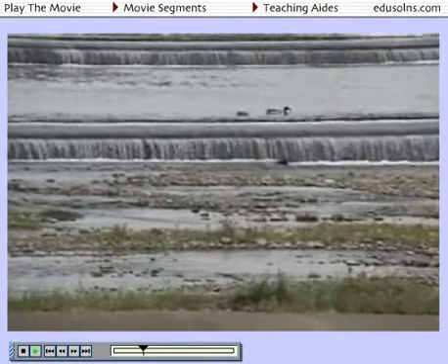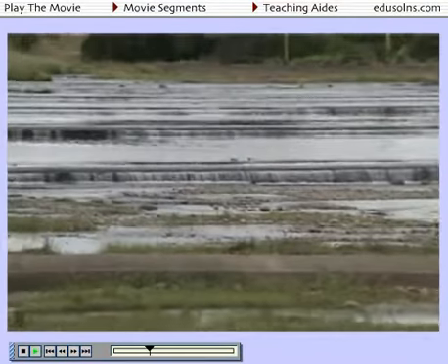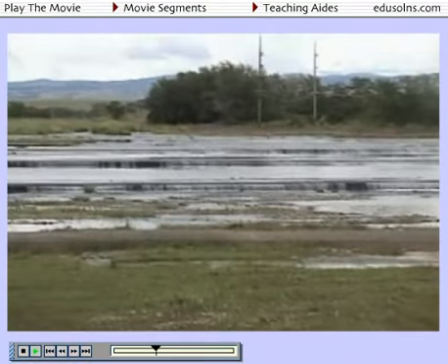Many agricultural chemicals wash into nearby lakes and streams and may affect wildlife. How can we determine when and where these chemicals enter an aquatic system?